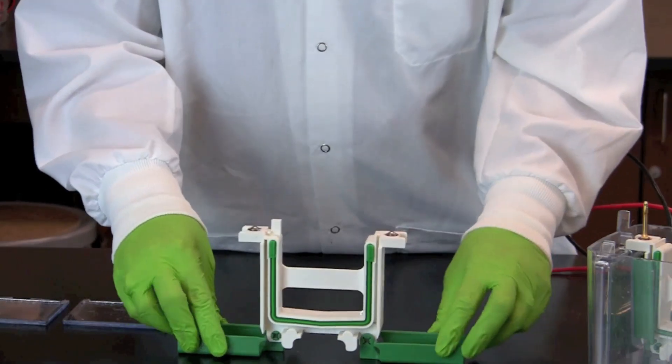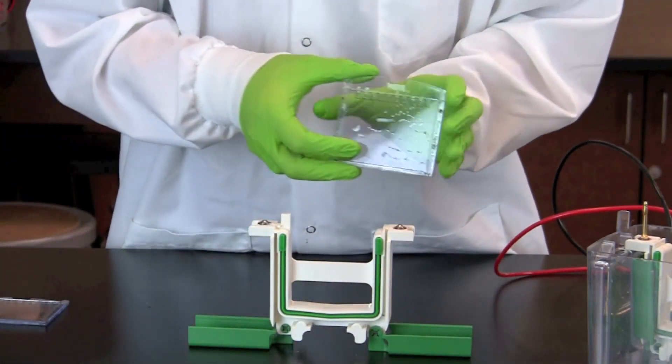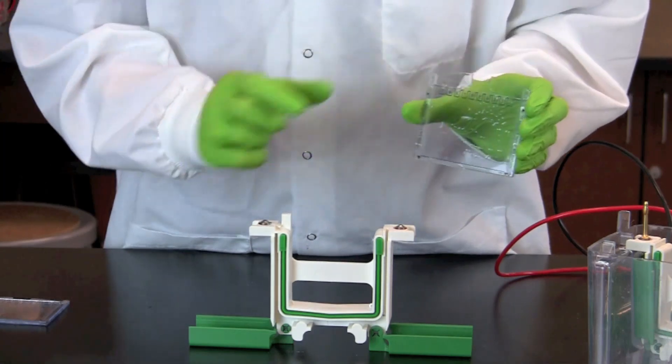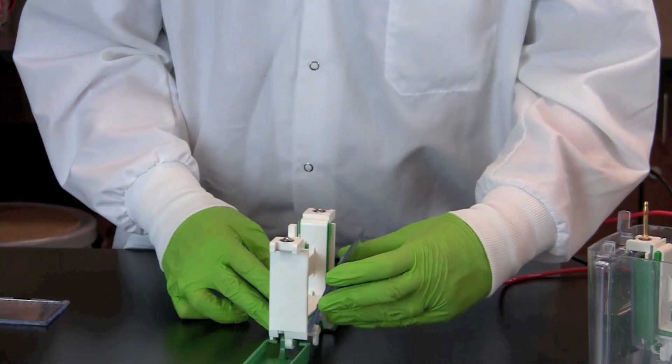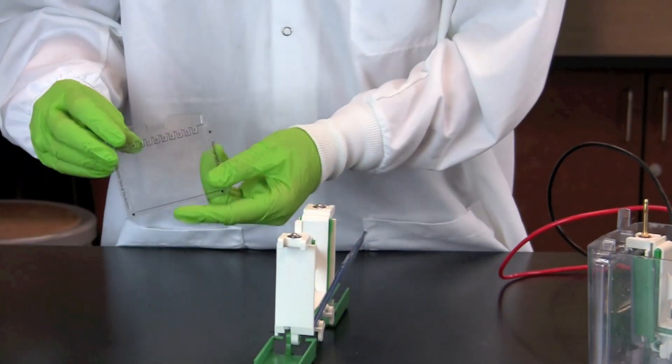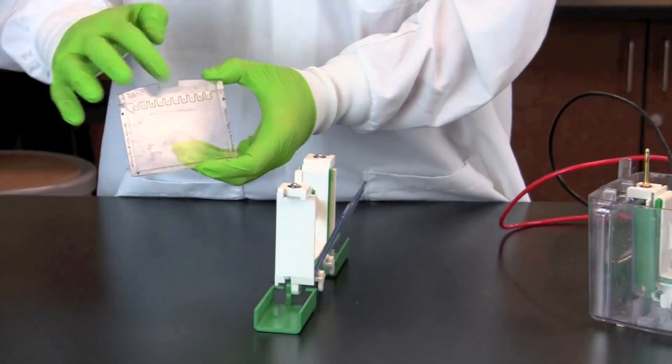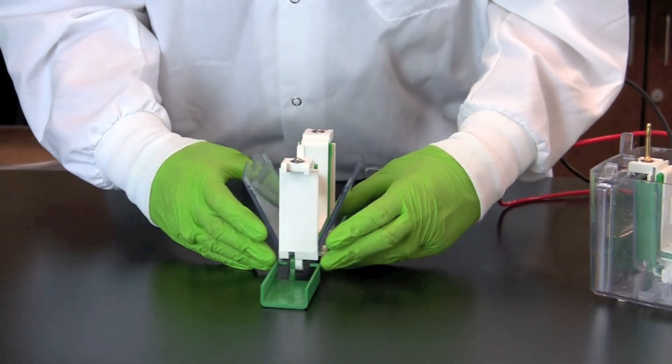Place a gel into the electrode assembly with the short plate facing inward. Place a second gel on the opposite side of the assembly. If only one gel is run, use a buffer dam to replace the second gel.